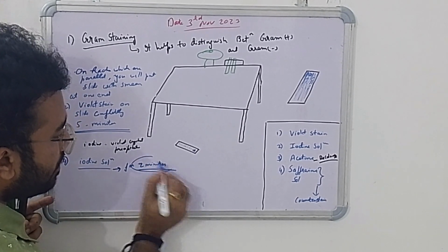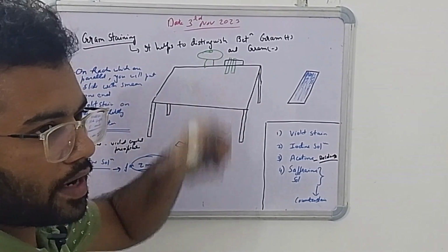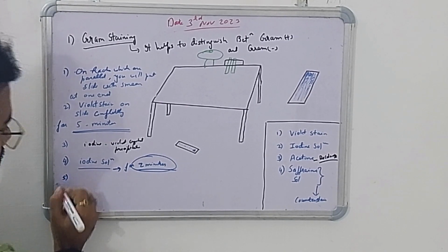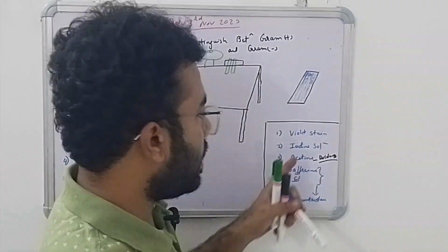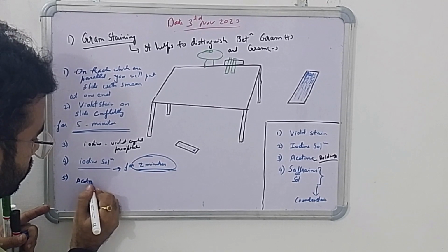Wait for 2 minutes and relax. After 2 minutes, add the decolorizer agent, acetone. Use acetone.